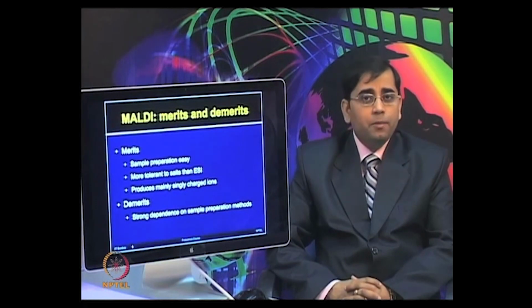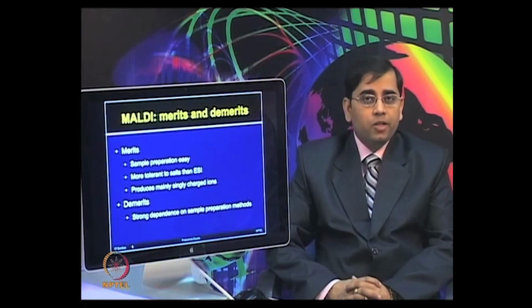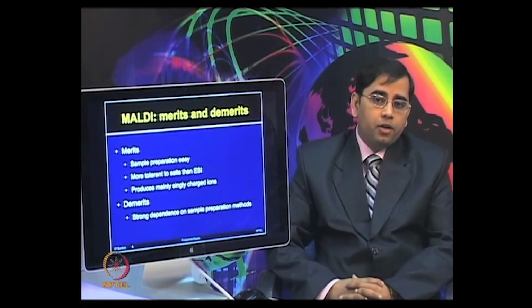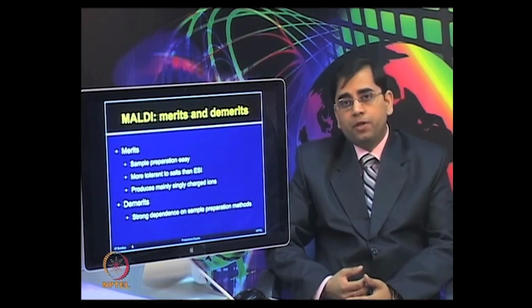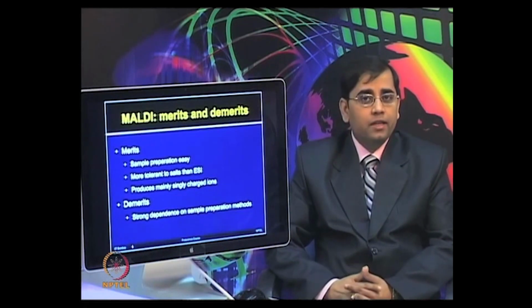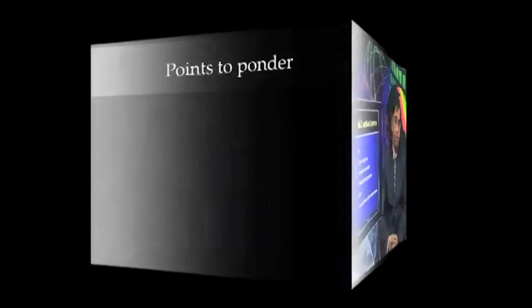Now, there are various demerits of using this system. There is a strong dependence on how to prepare good sample for this analysis. So, sample preparation methods heavily influence the spectrum generated from these experiments.